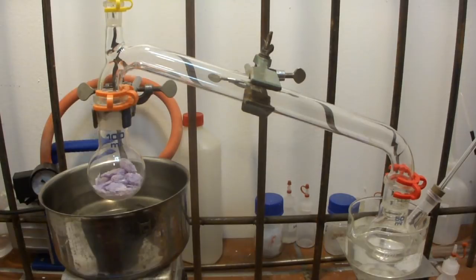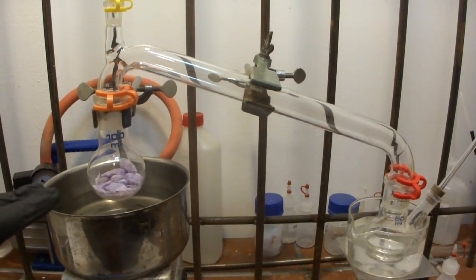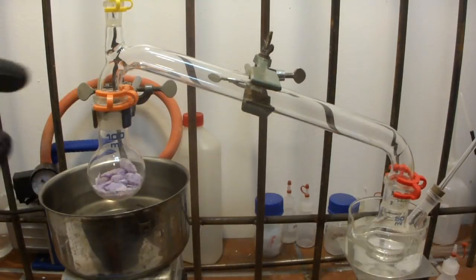Now, if you don't have a setup like this, you can also just take this flask right here and simply attach directly a Liebig condenser to it. You can then heat this flask and the trioxane would evaporate and be deposited on the inside of the Liebig condenser. After that, you can simply scrape it out or melt it out, so you could collect the trioxane in that way. We have decided to do this in this way, since it is the more proper way to do it, and since we don't have time to clean the Liebig condenser or to scrape it out, that would be just boring.